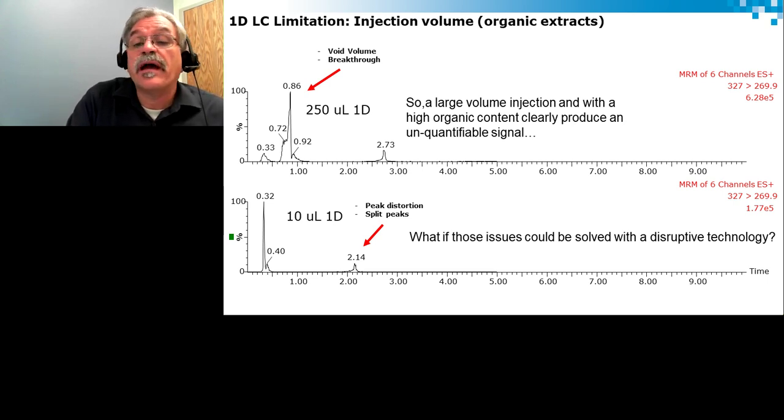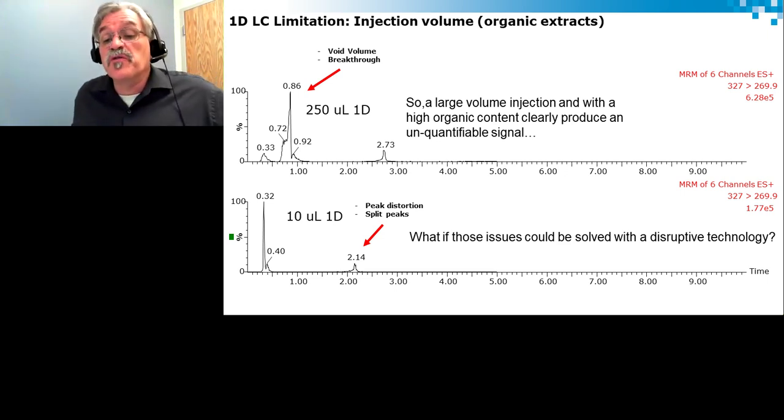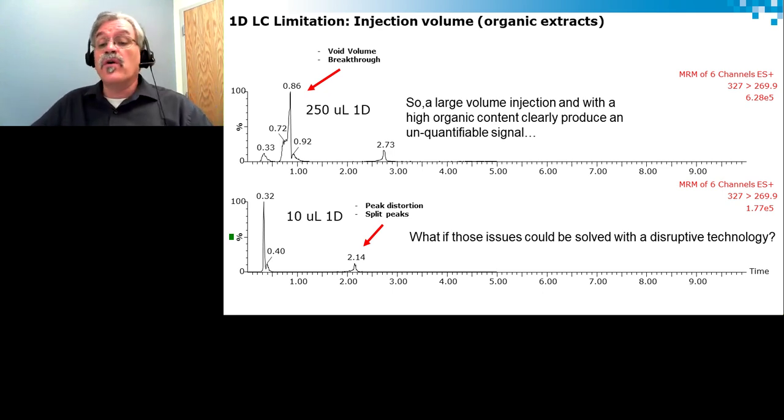up 100% organic? As one would expect, we have total breakthrough. Why? There's actually no retention. Even if I inject large volume, it's not going to make any difference. I still and will always have a large volume injection, or in this case, a breakthrough. So now we have here a scenario of what if those issues could be solved by a disruptive technology.